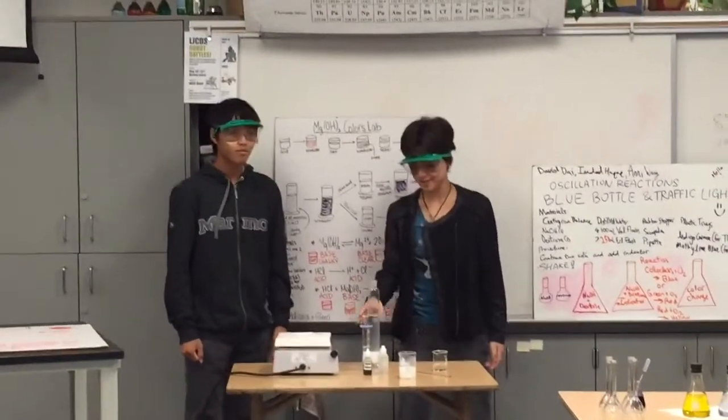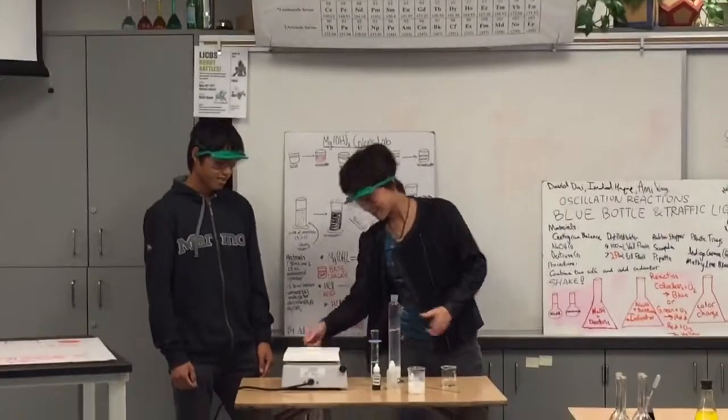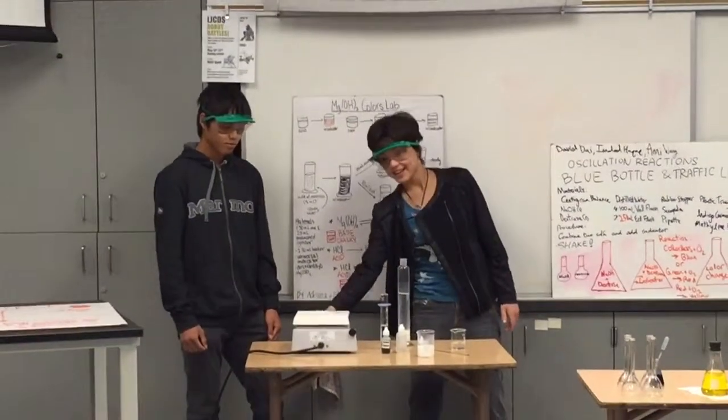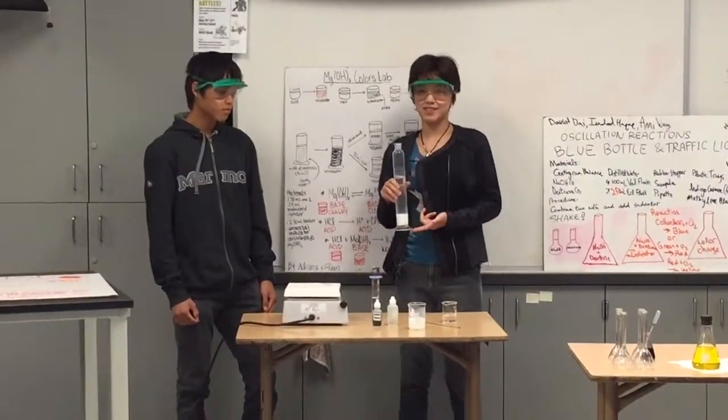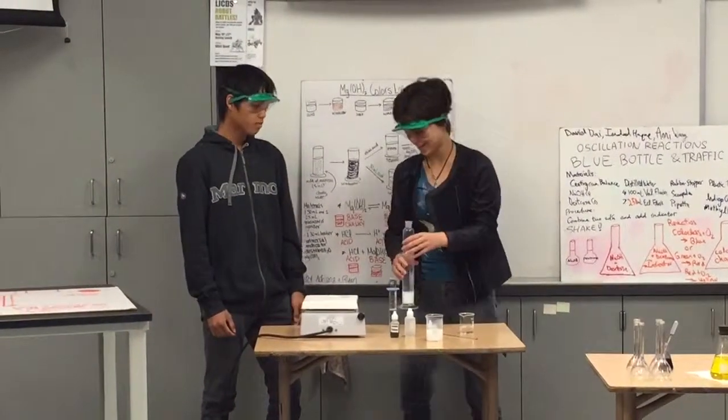This is a stir plate, which makes the solution stir. You can see it's spinning, which means there's a magnet inside here. So when you put it on, it'll spin, which makes this stir, even though we don't have anything directly in it.